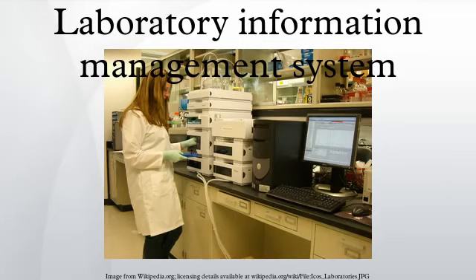Royal Infirmary, Glasgow highlighted this problem in the late 1990s by explaining how LIMS is perceived by an analyst, a laboratory manager, an information systems manager, and an accountant, all of them correct, but each of them limited by the user's own perceptions. Historically, the LIMS, LIS, and Process Development Execution System have all performed similar functions. Historically, the term LIMS has tended to be used to reference informatics systems targeted for environmental, research, or commercial analysis such as pharmaceutical or petrochemical work.